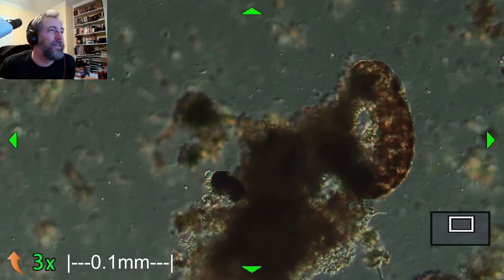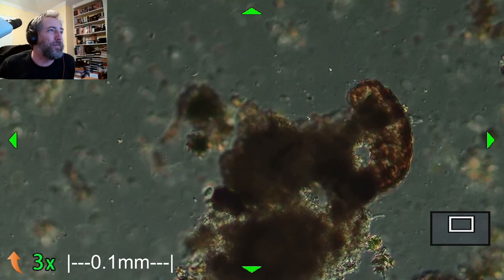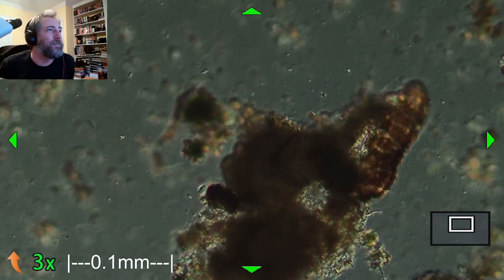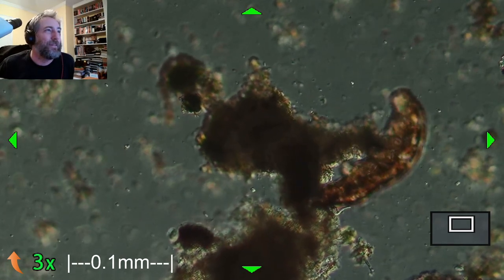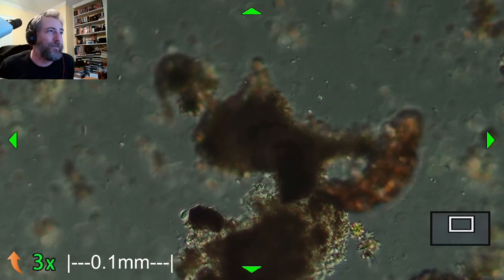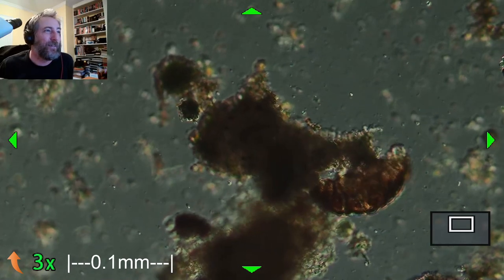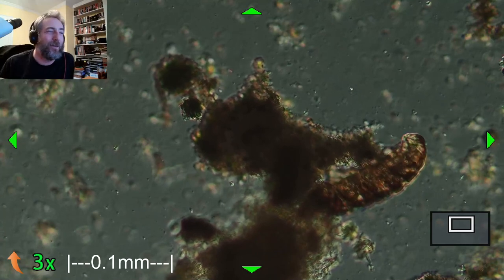Sometimes they'll eat lichen, but this one's probably perturbed because, you know, usually they're on a stick, which is a pretty stable surface. And right now this one's just on a sheet of glass, basically, because that's microscope slides. And so the particle that it's climbing around on is basically free to rotate, which normally it probably would be fixed.